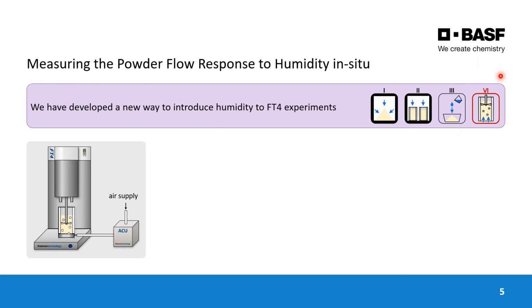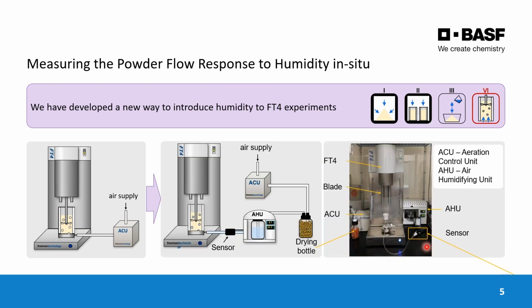So Mark 4 here, model number 4, is what we did. In Mark 4, we continuously pump humidified air through the sample base and humidify the bed during the actual experiment. That's a novel approach. Here we see in more detail how this is achieved.